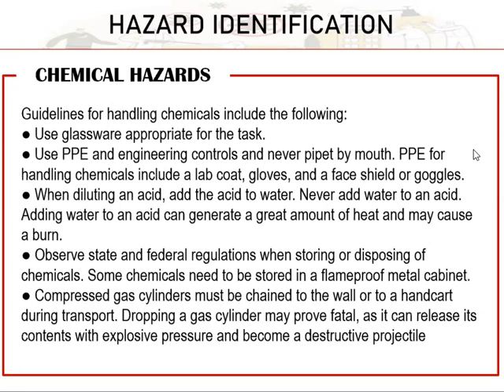Okay, so chemical hazards. This one includes potentially harmful chemicals that we are using in the laboratory. So that is why important gihapon to be reminded of the following guidelines. We need to use glasswares appropriate for the task. So avoid using plastics during reagent preparation. And then, when diluting an acid, add the acid to water. So una gyud si acid, then i-add siya sa water.